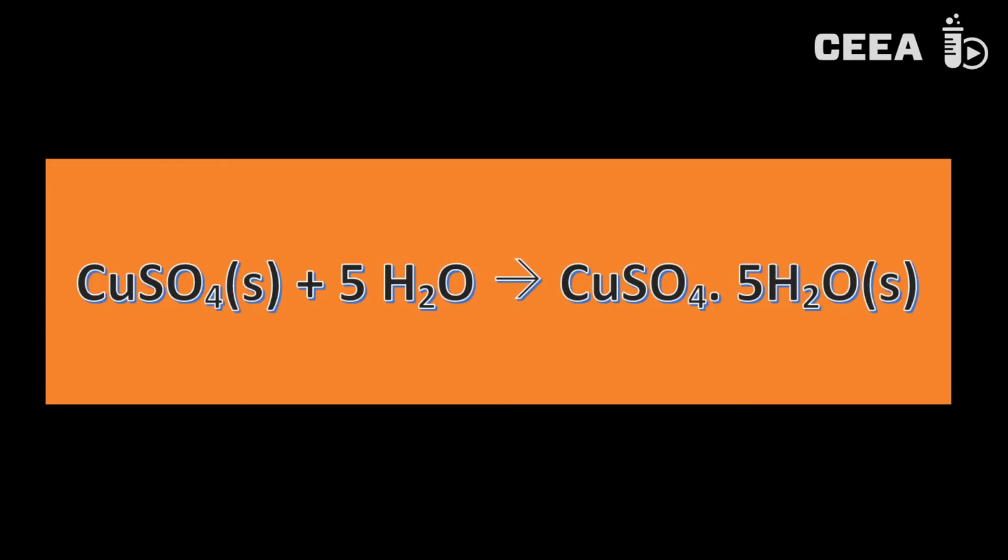The reaction equation. In copper sulphate, the copper ion can hydrate according to this equation. Note that the reaction is reversible. Dehydration occurs easily upon heating.